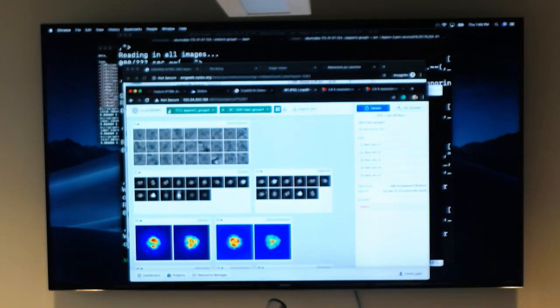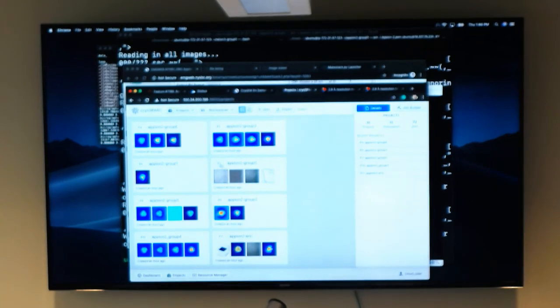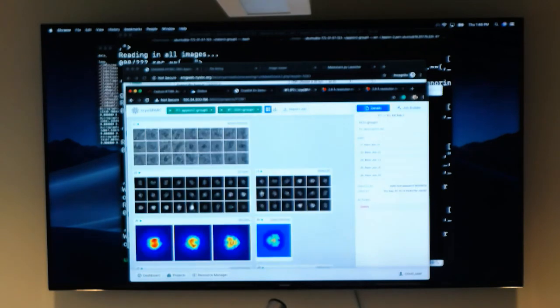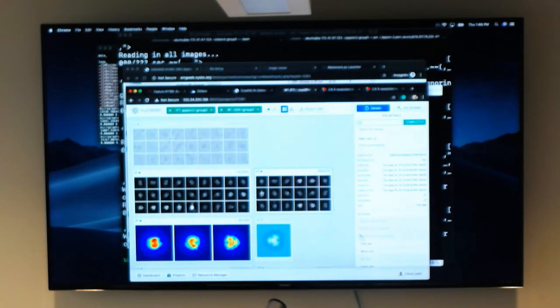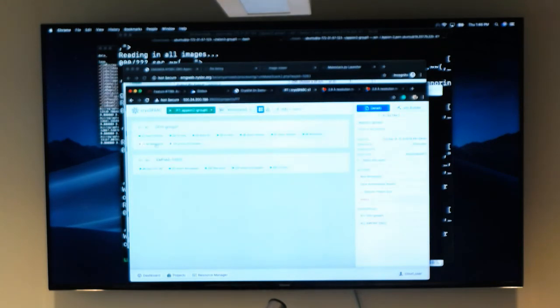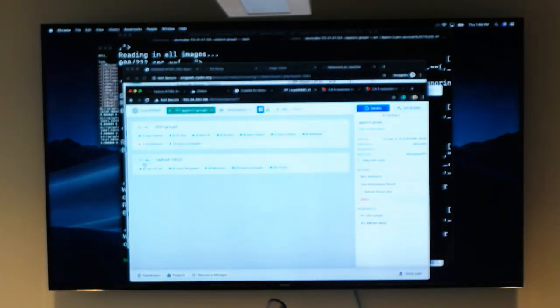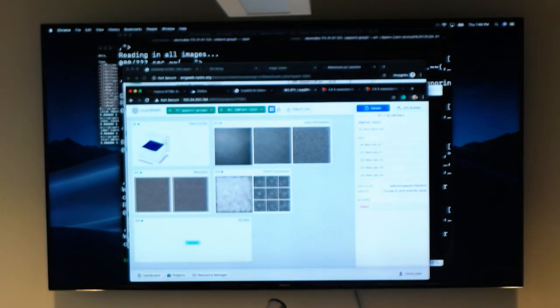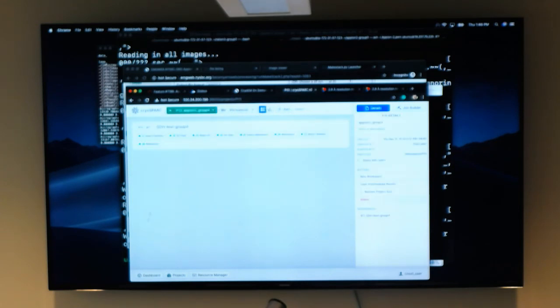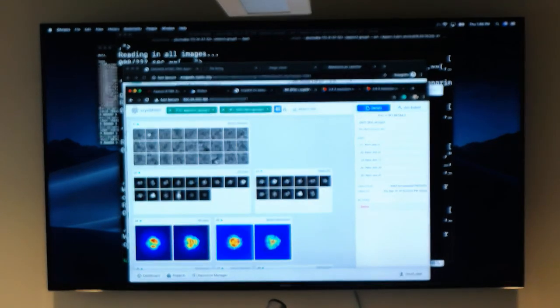Something that might be useful, let me pop into my group for a second. I have a couple of different workspaces. You can start a job and link the job to another workspace or move it, in case you started a job in the wrong area. You can move things within the project, and every time you start a job, it sequentially numbers them. Okay, so let's go into group 4 and see if I can interpret what was done.